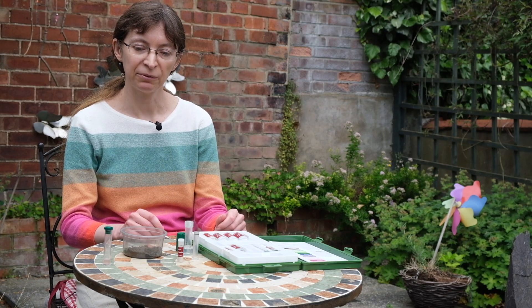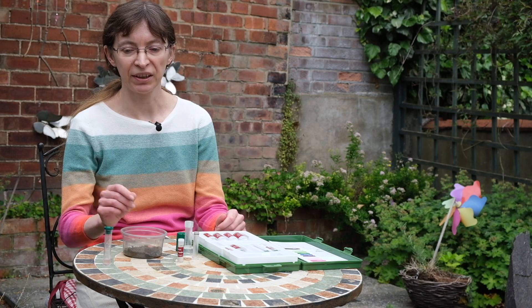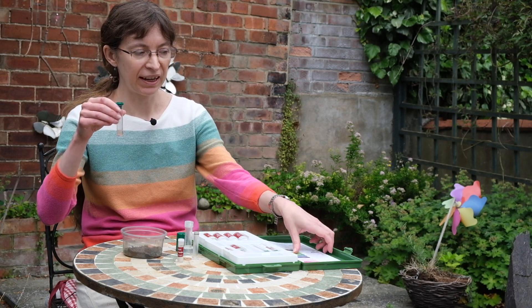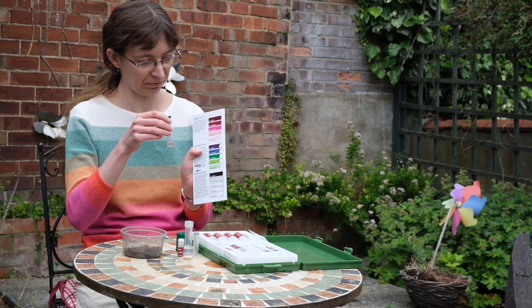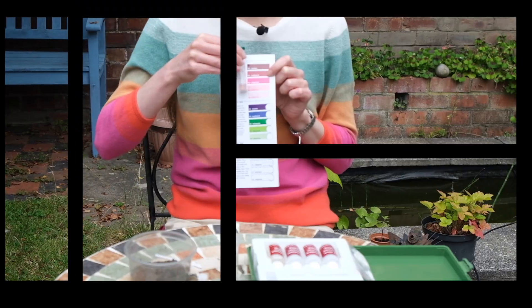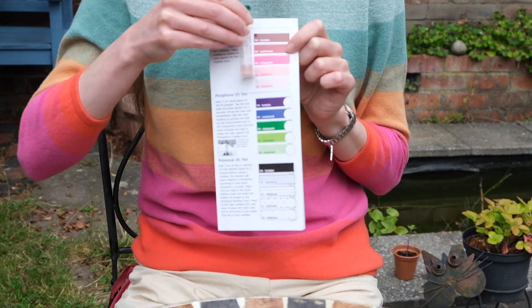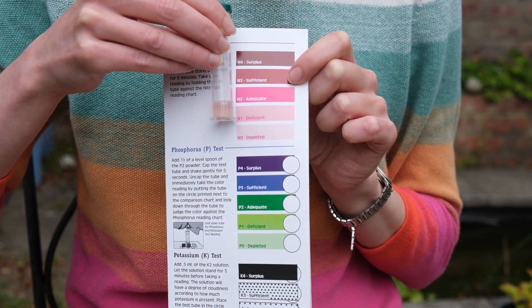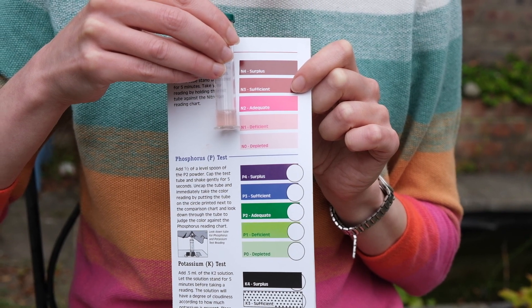In the meantime, five minutes have passed and the nitrogen test is also ready. We can compare it against the nitrogen color chart. The color of the solution is pale pink, which means that this soil is deficient in nitrogen.